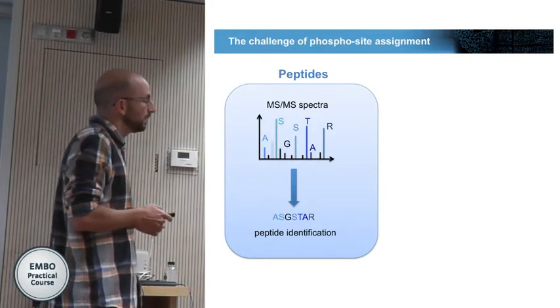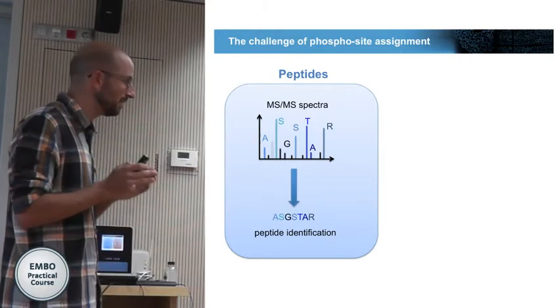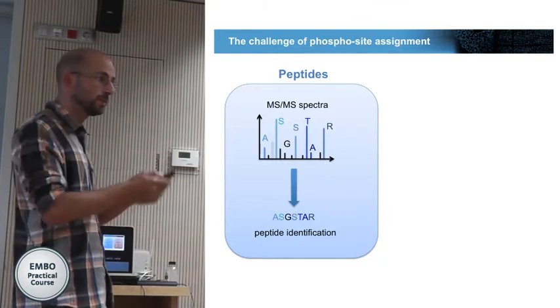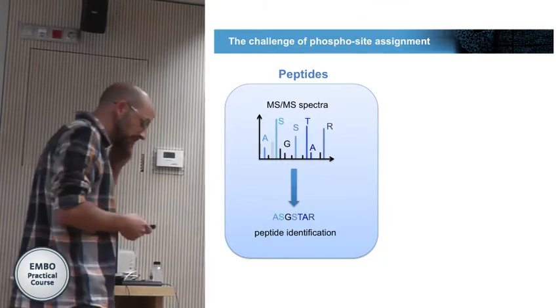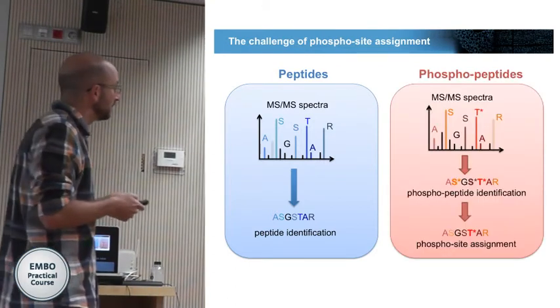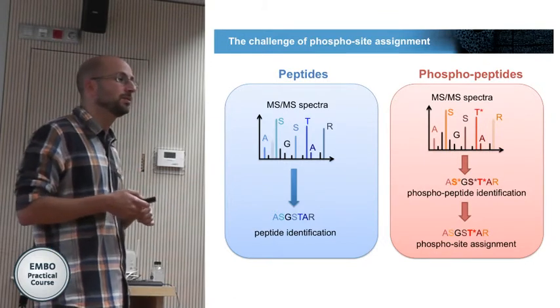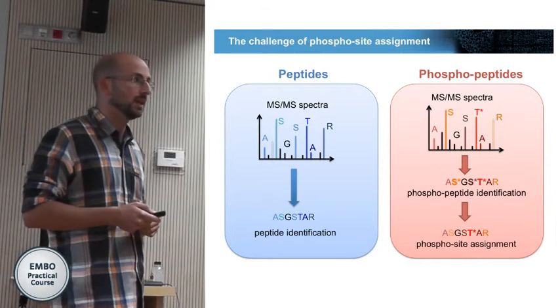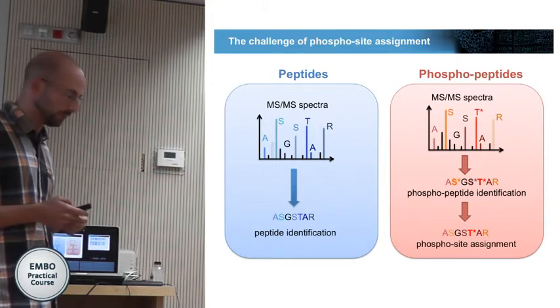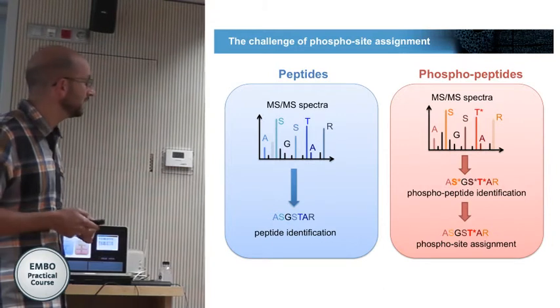And when we talk about peptides, till now we were working with this workflow of having a library and having some sort of peptide identification. We trust the identification with a certain score, and then we continue to make an assay out of it. And when we talk about phosphopeptides, there's another element, and that is not only the identification of the phosphopeptide, but also the identification of the right site. And so the localization of the site in phosphopeptides is very important, when we know which residue is phosphorylated. And this is not always an easy task. Actually, in most cases, it's quite a complicated task.